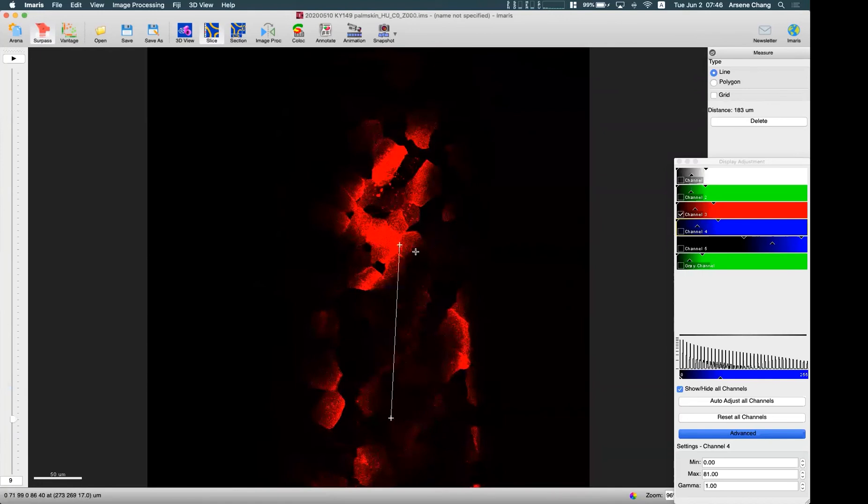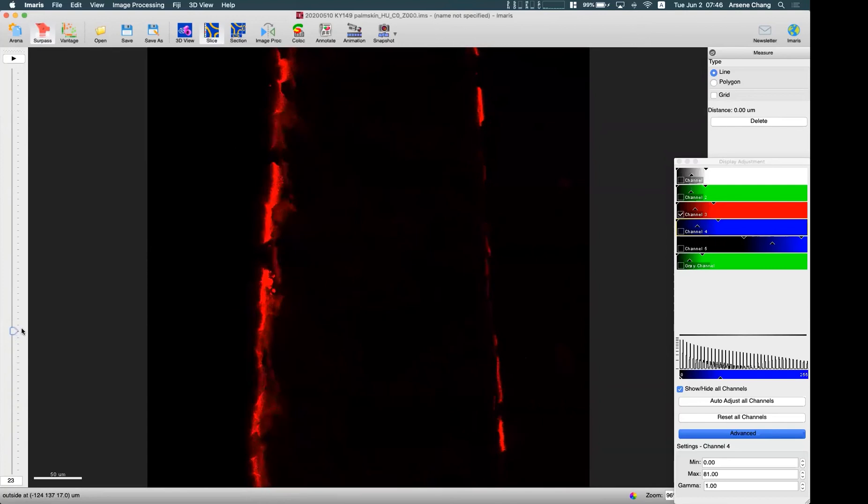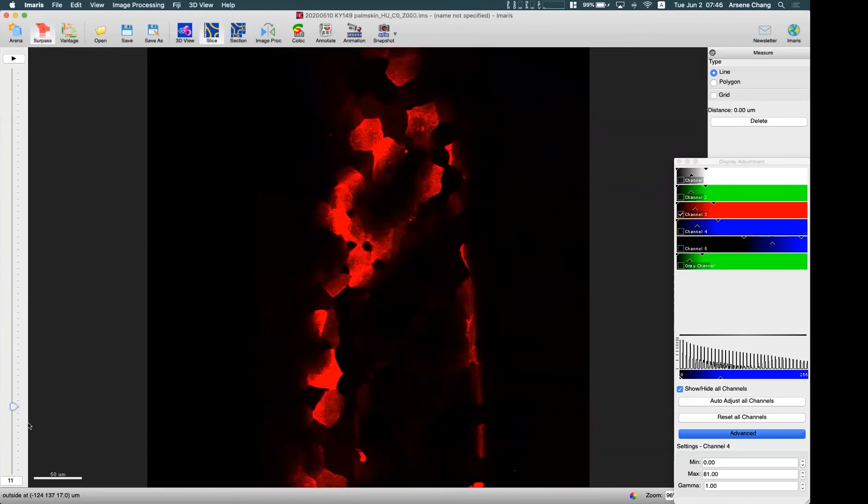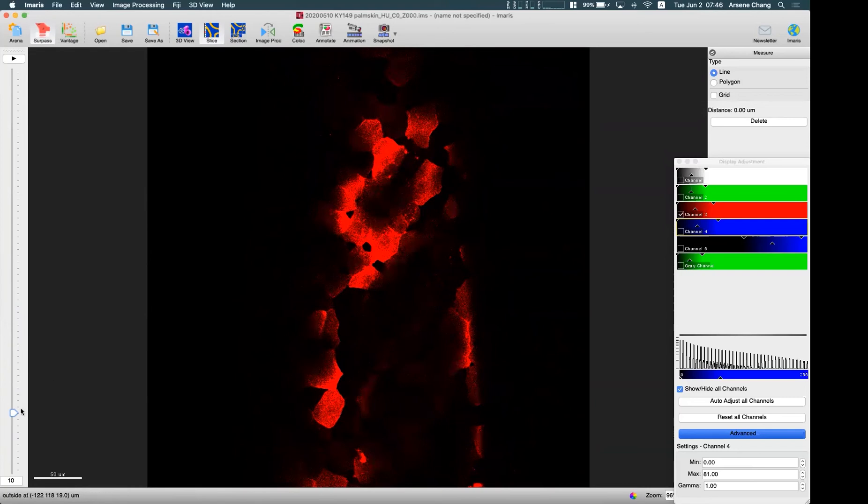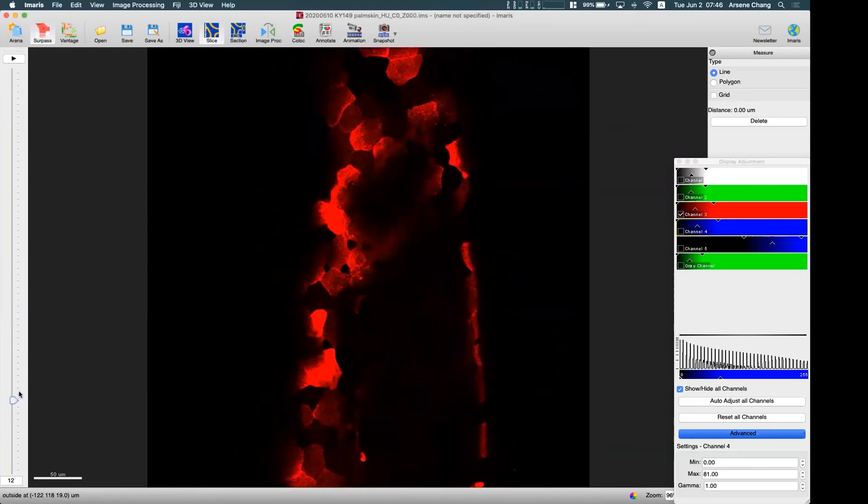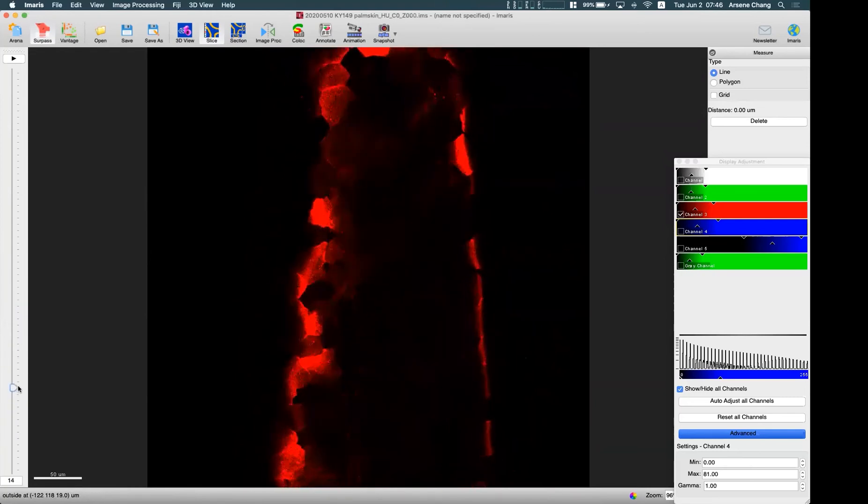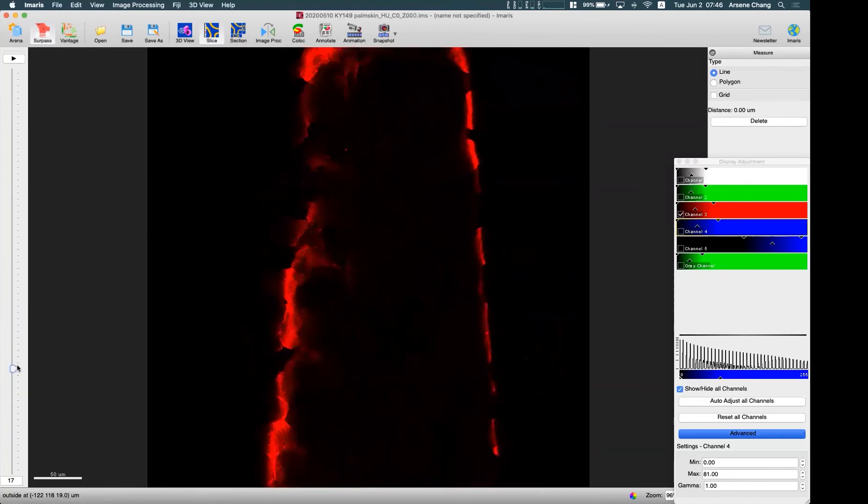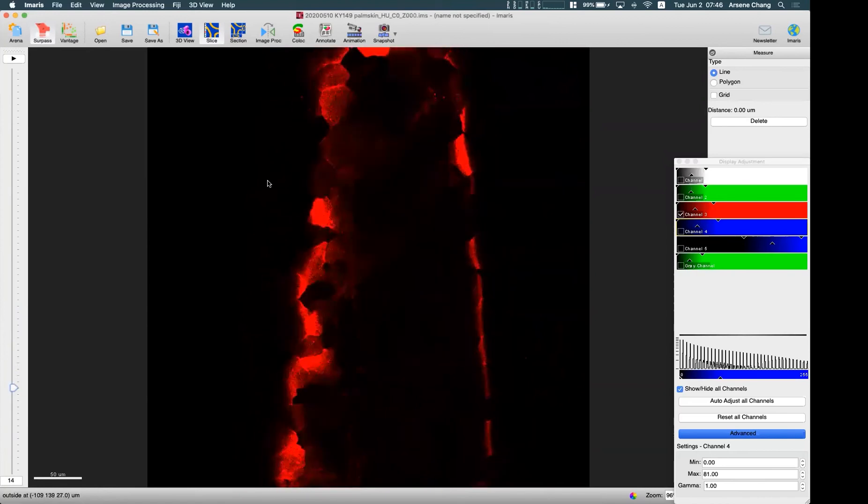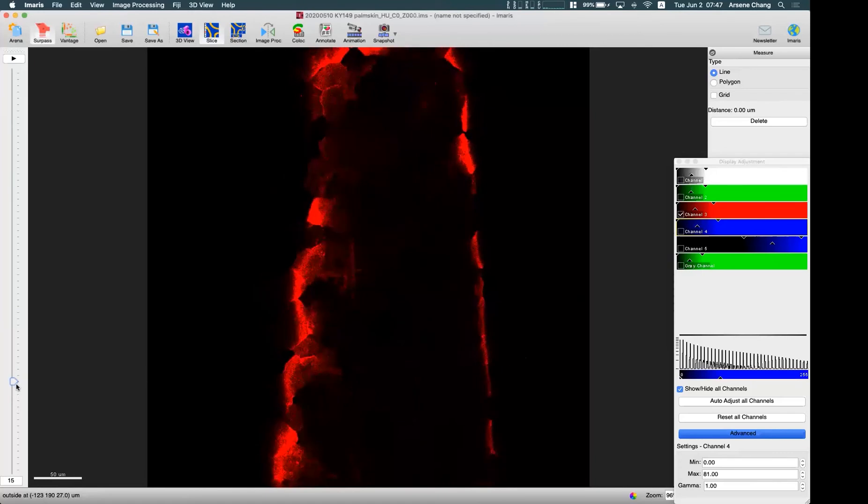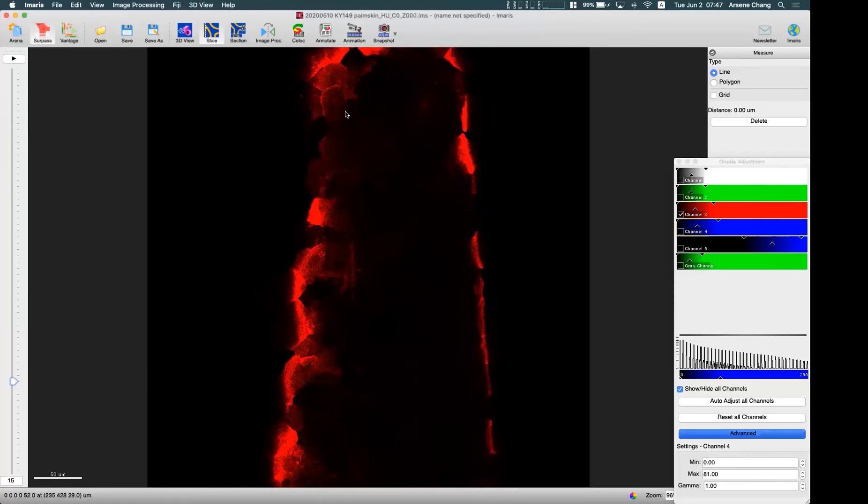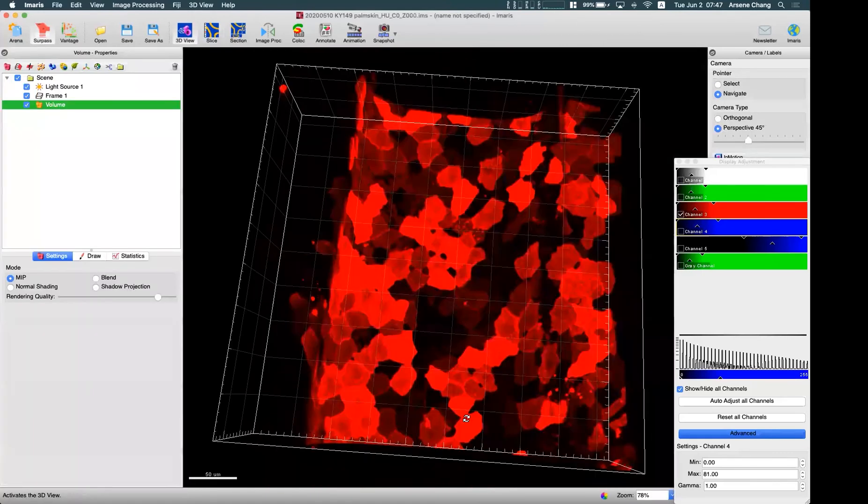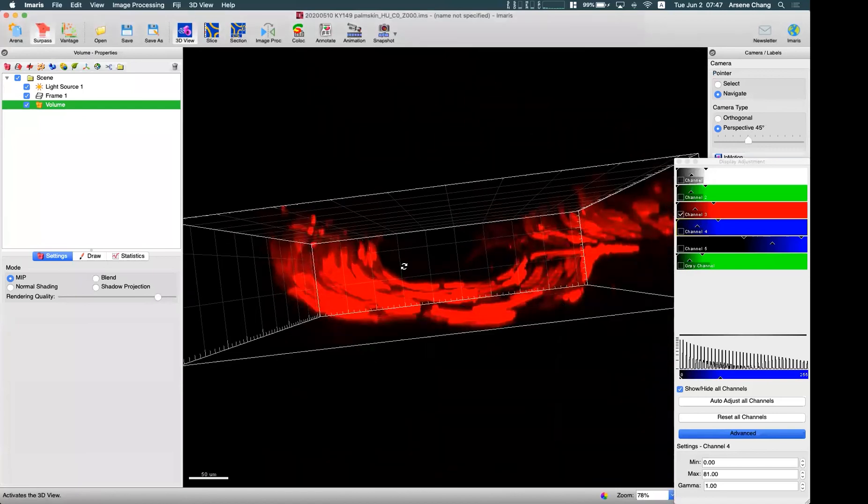It's very important to make sure we have this closing of the structure at the top and the bottom of each cell. So if there is no obvious closing, for example if this is a membrane or cytoplasm staining, if there is no closing of this structure when you do the cell detection, this volume will easily be out of the real size, real area, real staining area.